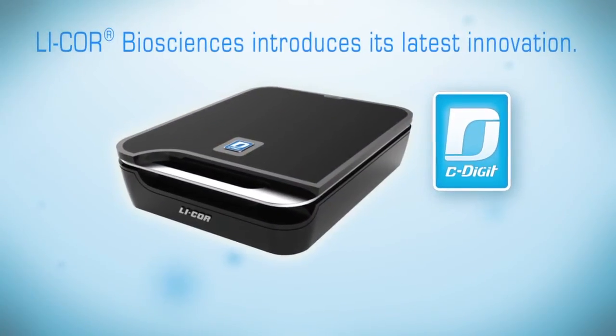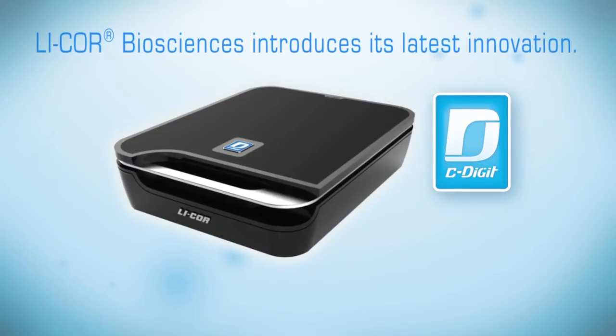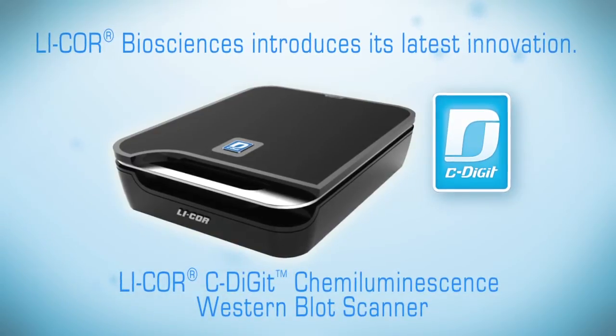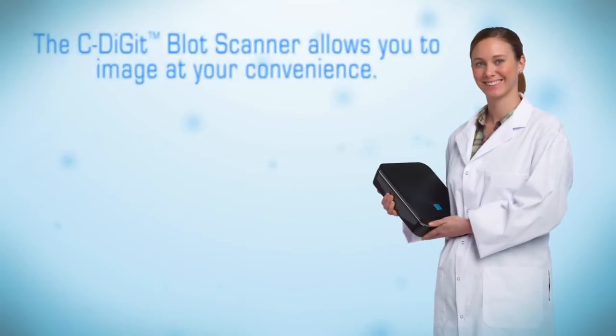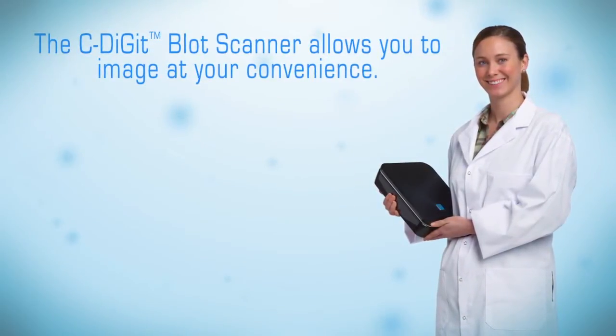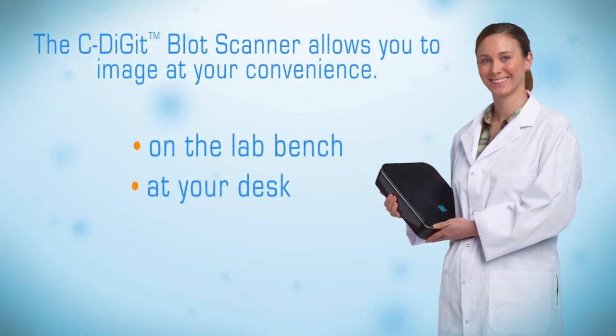LICOR Biosciences introduces the latest innovation and your new affordable lab partner: the LICOR C-Digit Chemiluminescence Western Blot Scanner. The new way to develop film quality images without the hassle and expense of film development. The C-Digit Blot Scanner allows you to image at your convenience — on your lab bench, at your desk, or anywhere you choose.